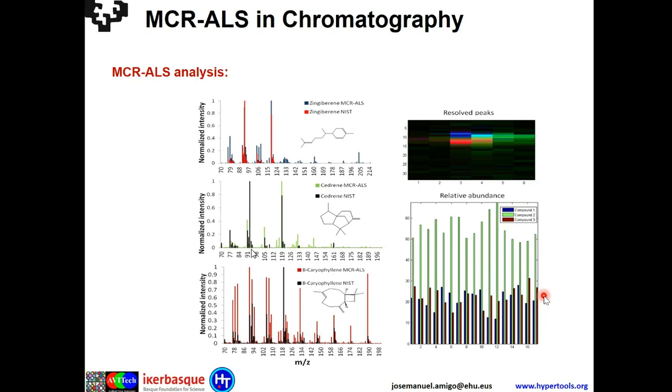Okay, so this is one of the classical cases in which you can use multivariate curve resolution, and it works really nicely because the trilinearity problems are skipped: we unfold in a way that all our trilinearity problems disappear and we just stay with a bilinear model.